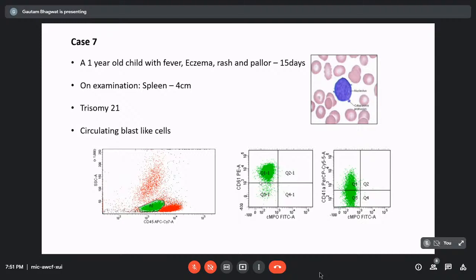Now in these cases again you might have a CD34 positive or negative. The 45 would be dim to negative. So again, how do I come to a diagnosis? I take the clinical features, trisomy 21. I take the morphological features, that is presence of the cytoplasmic protrusion on my blast, and then putting my markers accordingly and giving a lineage diagnosis of acute megakaryocytic leukemia.